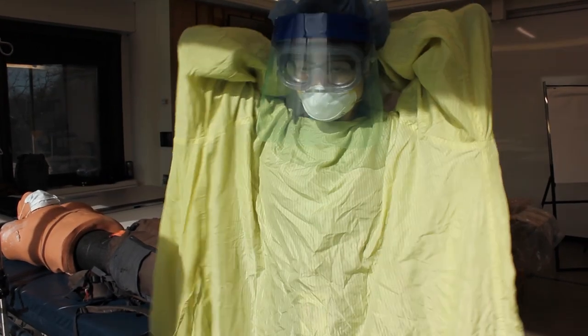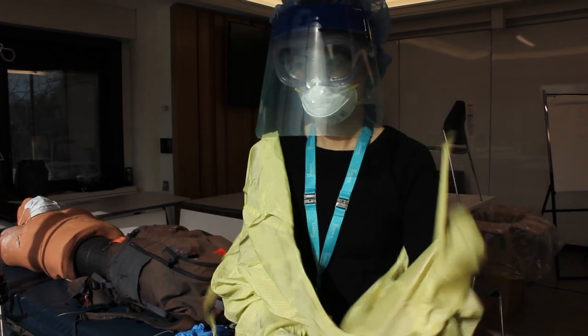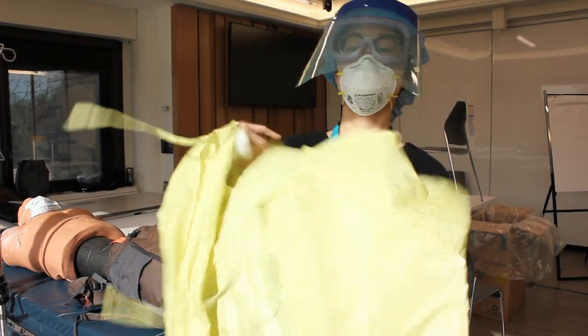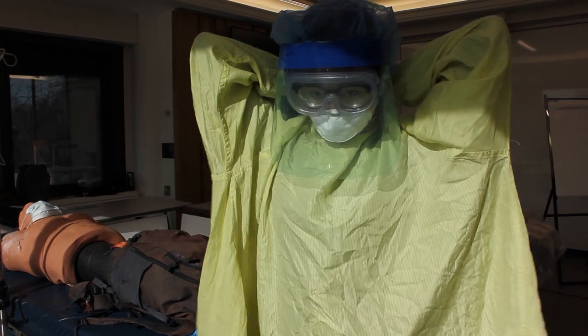Nancy, can you untie at the neck for a second and then remove — improperly. That is wrong. Put it back on quickly, Nancy. And if you can just show us you're untying the top and how to take it off properly again.